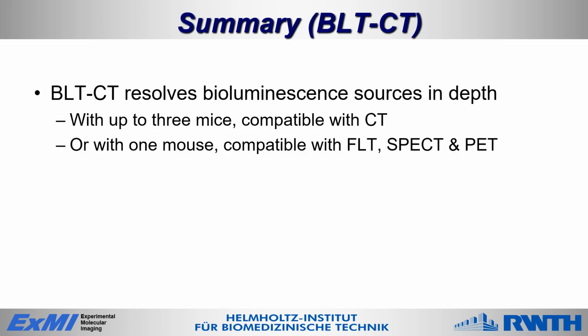In summary, we can say that BLT resolves bioluminescence sources in depth with up to 3 mice and is compatible with micro-CT. Or if you use it with 1 mouse, it's compatible also with FLT and SPECT and PET.